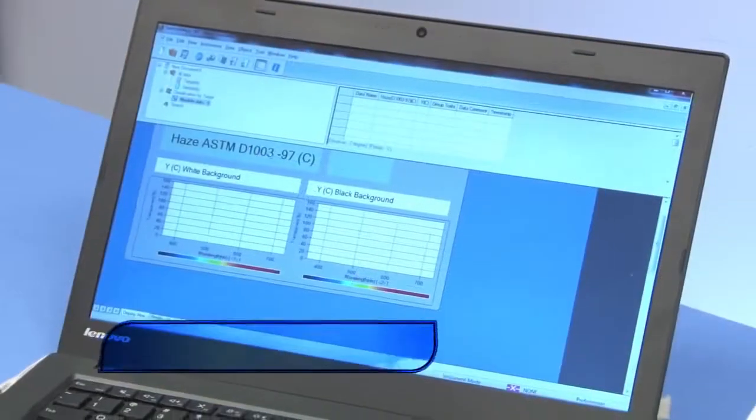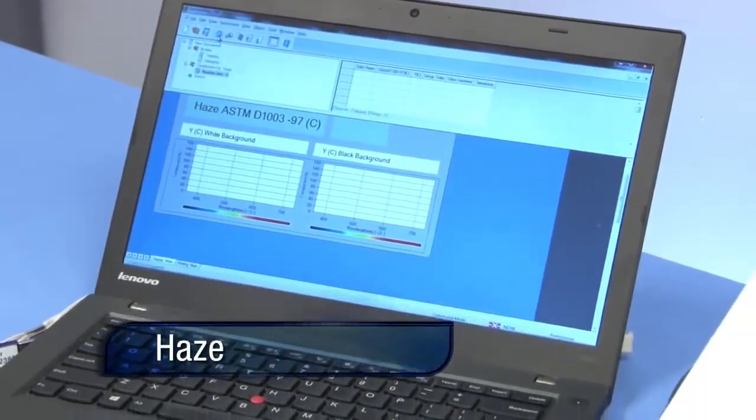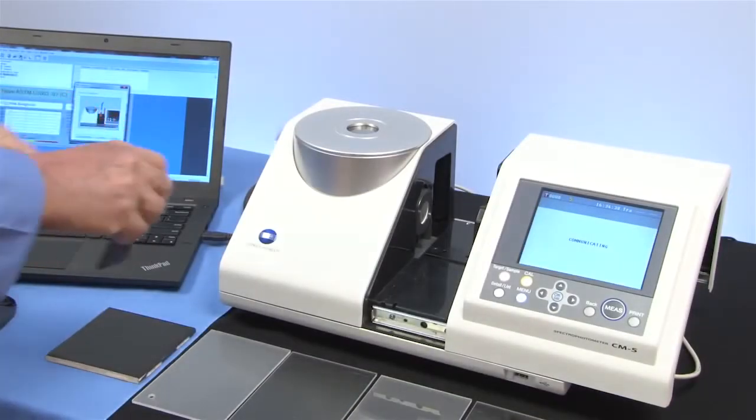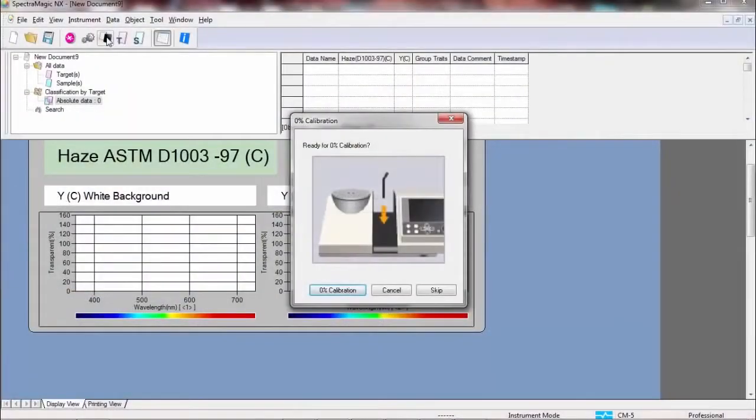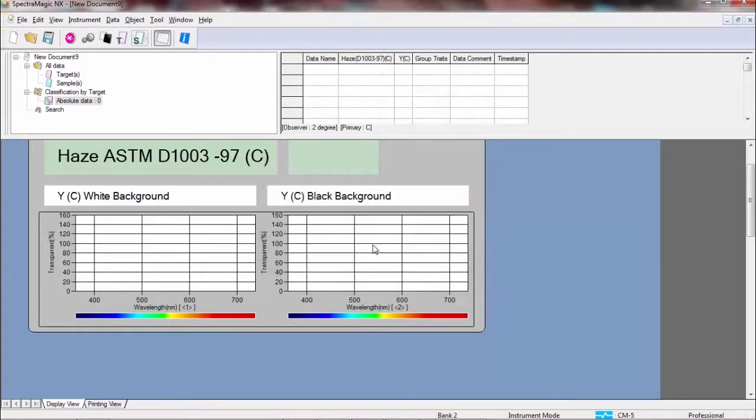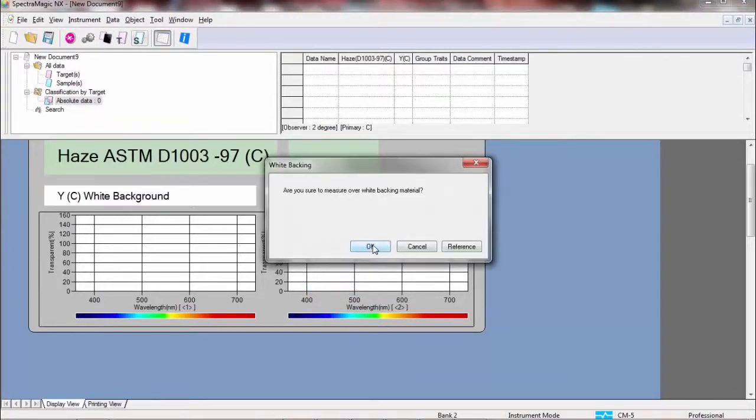For haze measurements, the CM5 is driven by user-friendly Konica Minolta sensing SpectraMagic NX software. This procedure requires a measurement over a contrasting background. When creating a target, you will be prompted to take two measurements for each reading, one over white and the other over black.